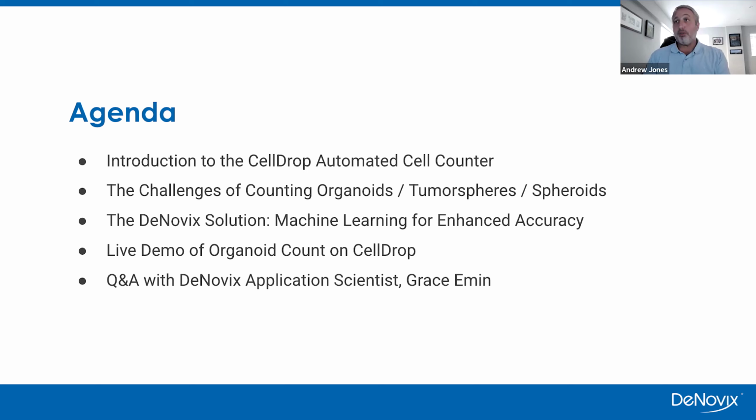So the title of today's webinar is Automated Organoid Counting, and we'll be using the DeNovix CellDrop Automated Cell Counter for this.